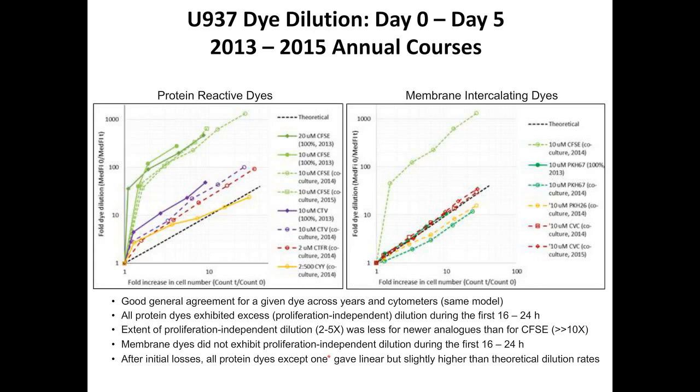If you look at that curve a little closer, you'll see that in essentially the first day, that decrease is at a much higher rate than the decrease that you see at subsequent days. That's true if you look closely at all the other protein dyes, that there's a different kinetics to the loss of dye in the early stages than there is in the subsequent stages.